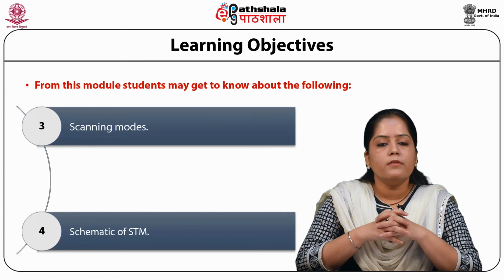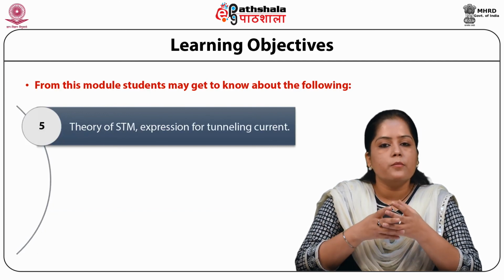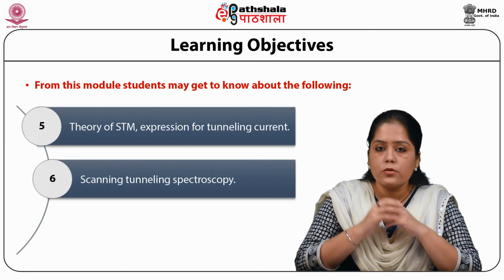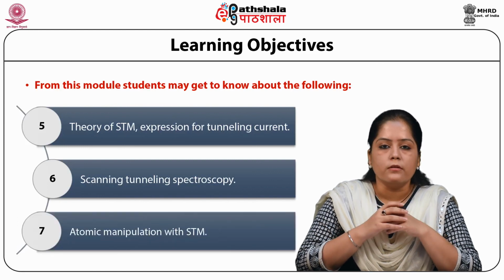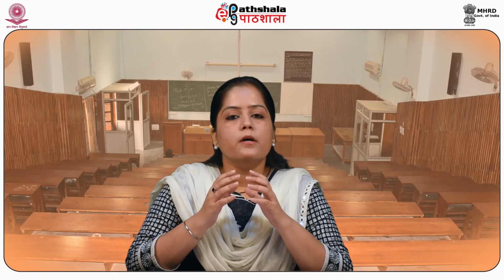After this, we will discuss the theory of STM, that is, to determine the expression for tunneling current. Then we will discuss scanning tunneling spectroscopy. Lastly, we will discuss how atomic manipulation is done with STM. So students, let us start with a basic introduction about the module.